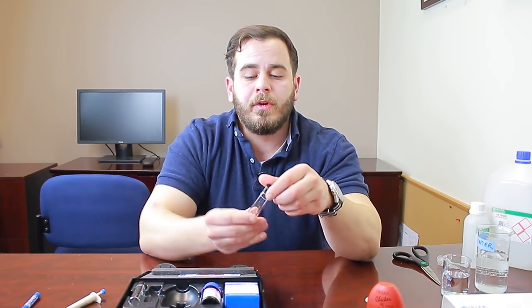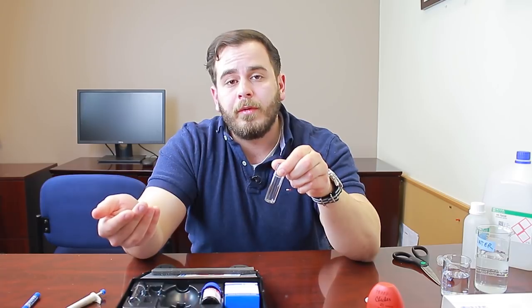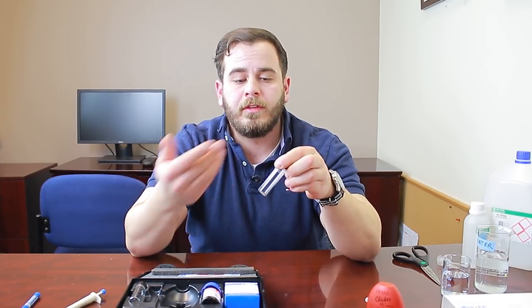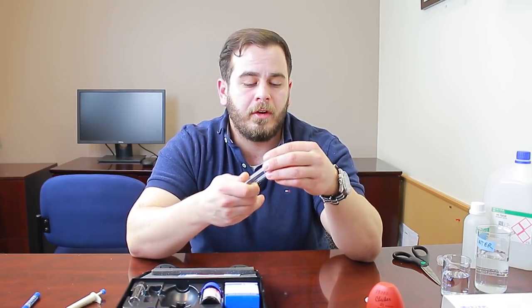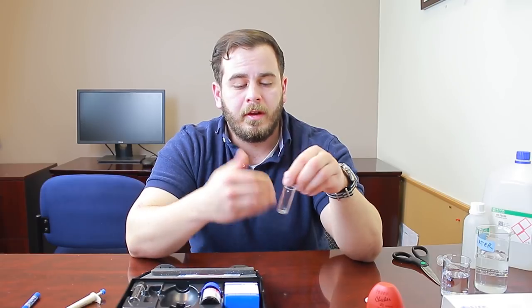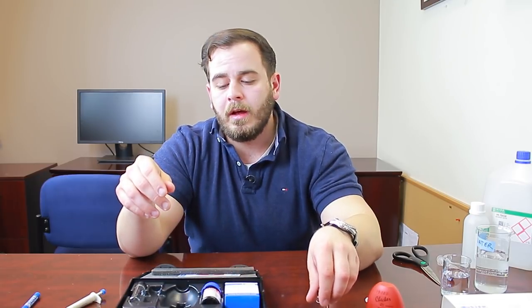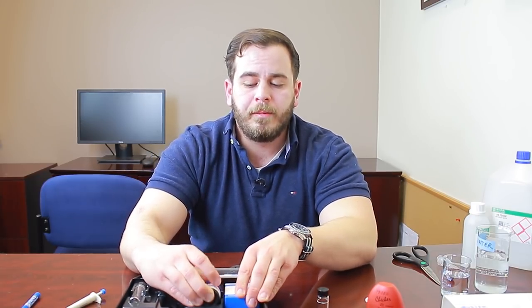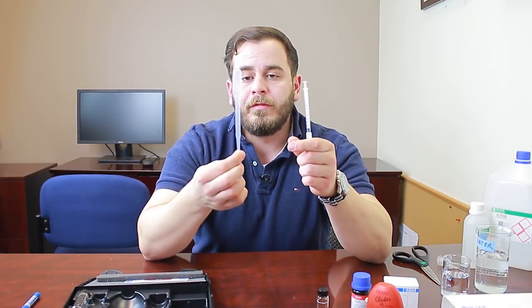We give you two cuvettes because it's important to keep them clean and free of scratches — we include a spare in case you drop or scratch one. Salt water can cause staining on glass, so you always want to keep these optically clear since these are optical-based measurements. The test comes with two reagents: a liquid bottle of reagent A and powder sachets of reagent B, plus a 1 mL syringe for the liquid reagent and a separate pipette to fill your cuvette with RODI water.